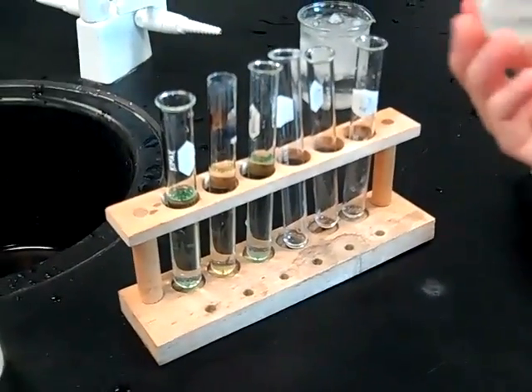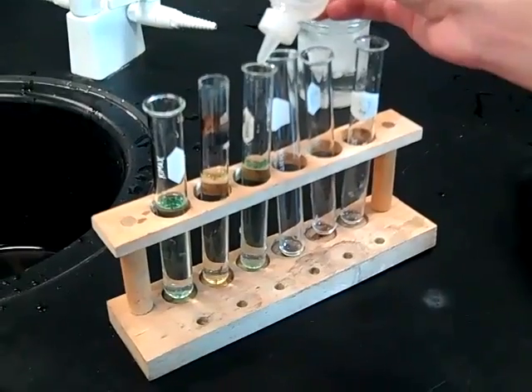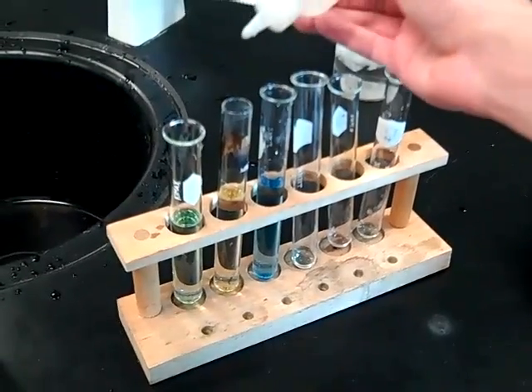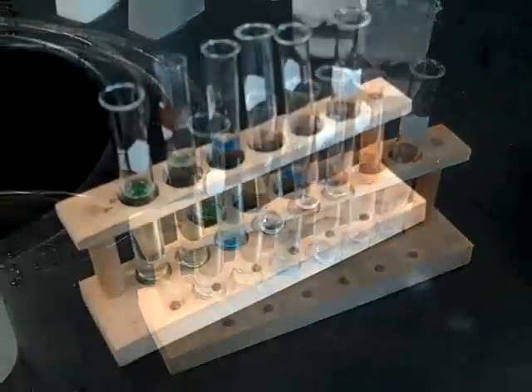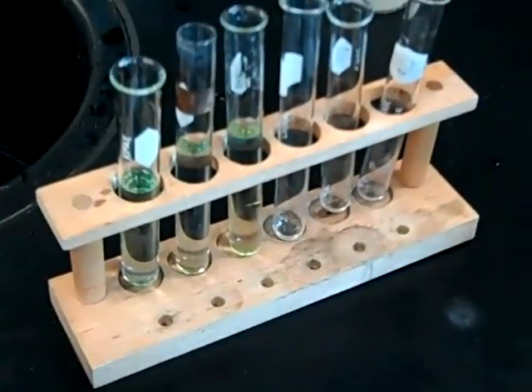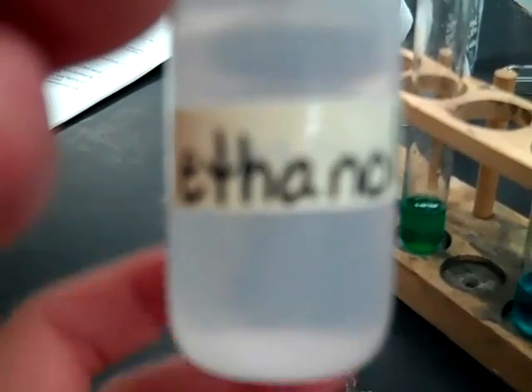Now I'm adding two drops of 0.1 molar hydrochloric acid to test tube warm. I am now adding 0.1 molar NaOH to the third test tube. Now I'm adding NaOH to test tube two. Now I'm adding HCl to test tube three. So now everything is back to green.